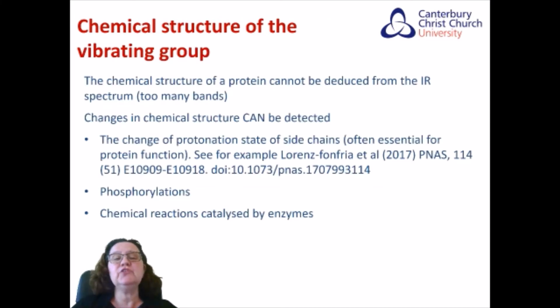You cannot deduce the structure of a protein exclusively from the infrared spectrum. There are too many bands. However, what you can really observe is changes in the structure. For example, because of the protonation of side chains, you can follow phosphorylations, you can follow enzyme activity, because you can detect the changes in the protein's structure before and after the reaction takes place, or protonation, for example.